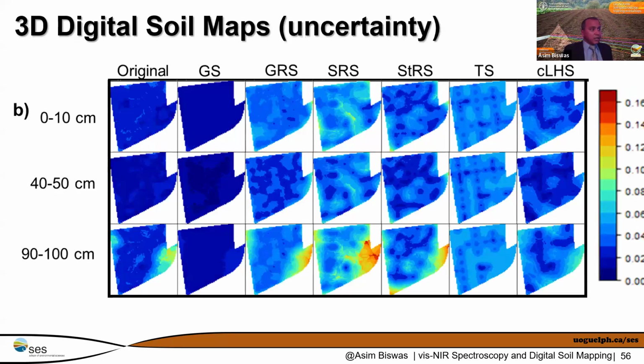And not only that, for each of those measurements we can calculate and see the variation. You can clearly see the high uncertainty at depth with grid random or stratified random sampling. Anything with a random sample associated, we tend to have quite a bit of uncertainty. The main reason is that we had a very small amount of sample representation, so we did not have much of a representation there. This is also where the road impact comes in, if we look at some of the physical meaning of it. As for the transect sample, you can see the low amount of variation of the points, and you clearly see those variations as well.